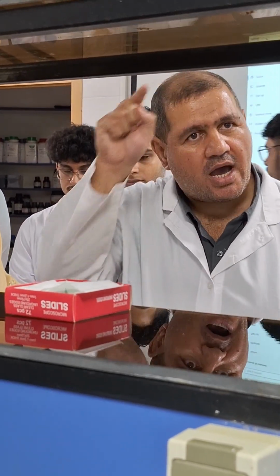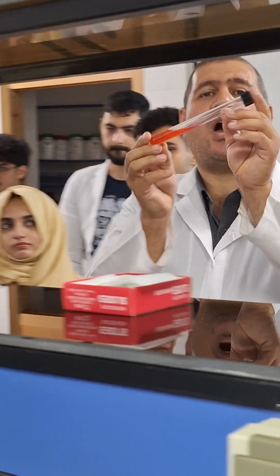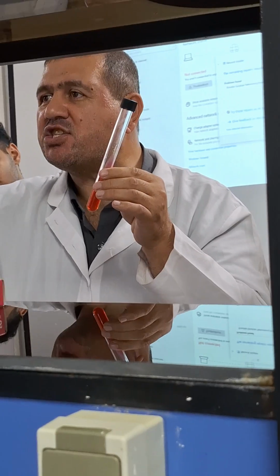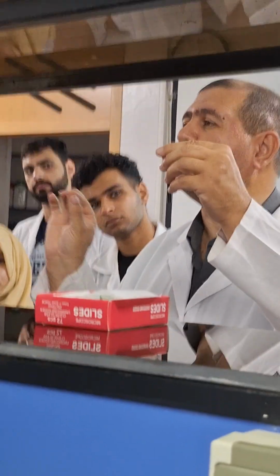Culture your plate according to isolation method. A, B, C, D. To culture on a slant medium, we use fish-tail method. For this, you must use a needle, no loop.